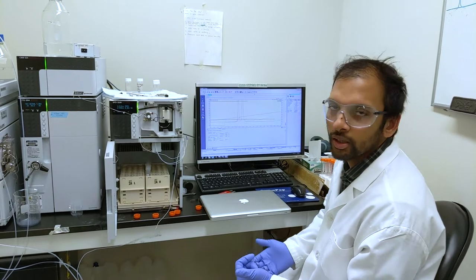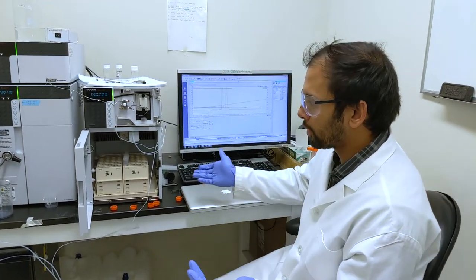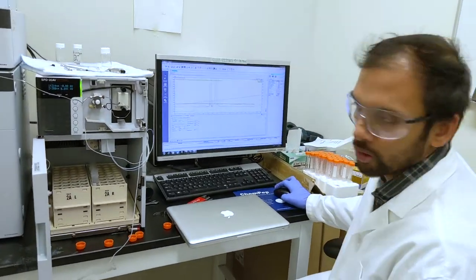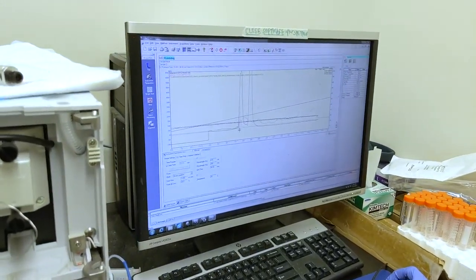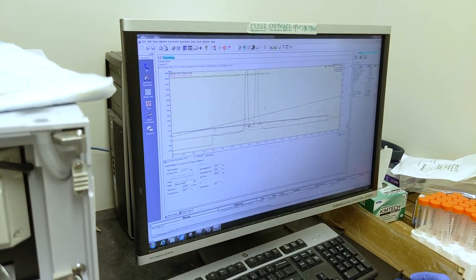Once we screen them and pick a couple of really good candidate peptides, we then make them and purify them by HPLC. So that's what I'm up to today, collecting peaks that correspond to the peptides I want. You see this peak here, that's some peptide, and I've collected it. After this is done, I'm going to head over to chemistry and do some mass spec to confirm its identity.